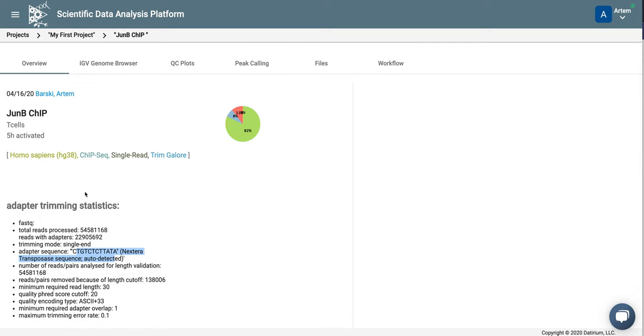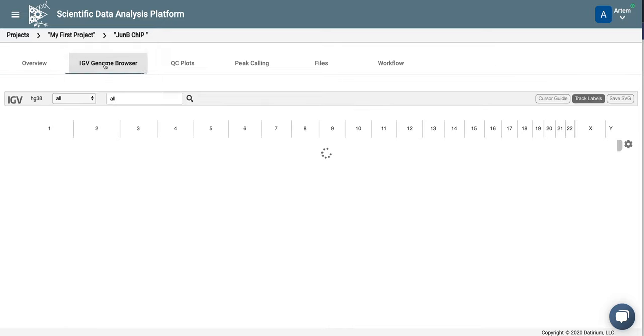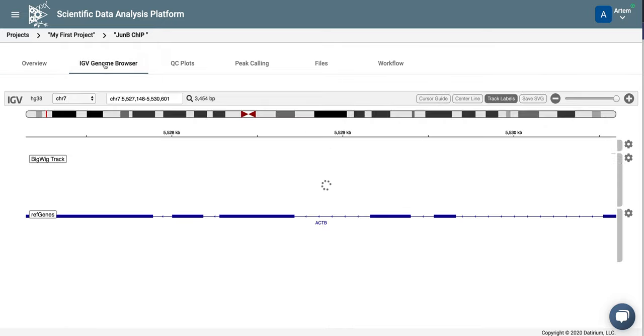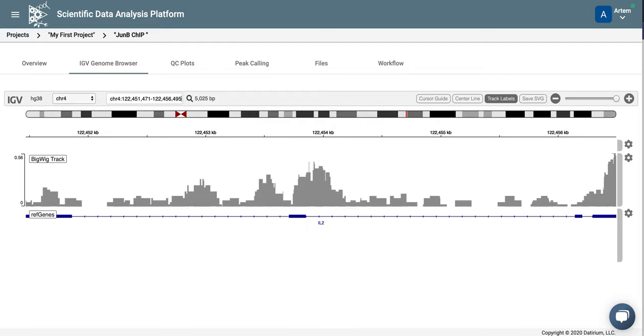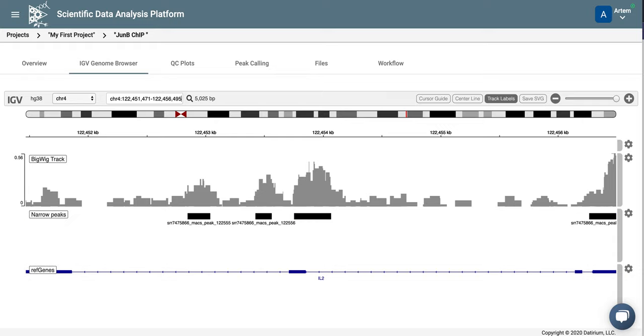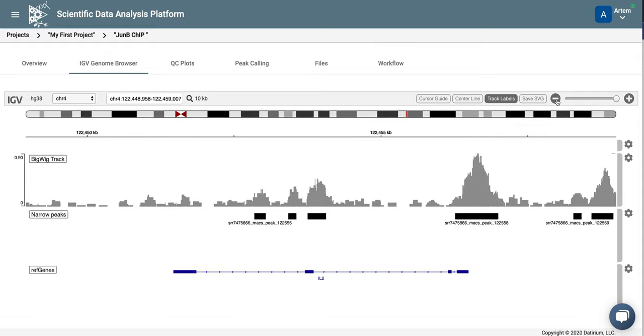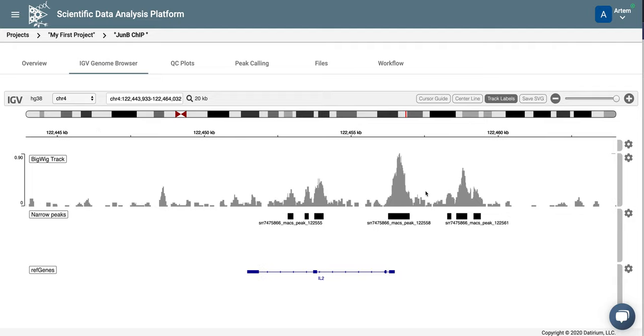Let's look at our peaks on the genome browser. So here we click at IGV Genome Browser tab and wait for the data to load. Since this is JunB in T-cells, let's look at the IL-2 gene. Here you can see the peak coverage, the coverage by reads around the IL-2 gene. Let's zoom out to see the peaks better. So these are the big peaks.